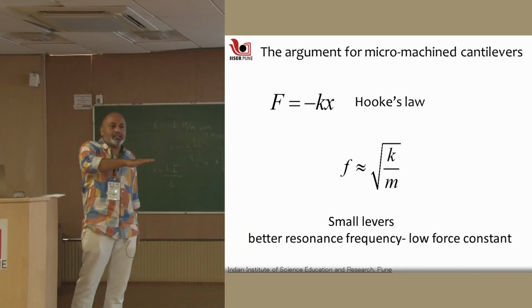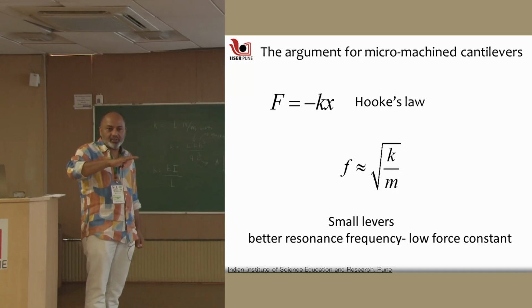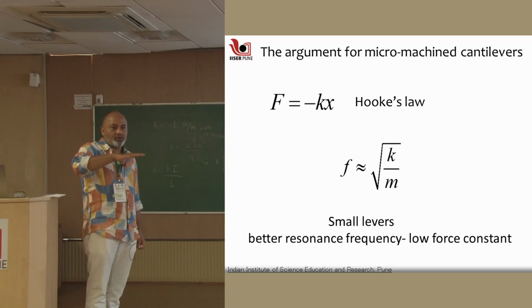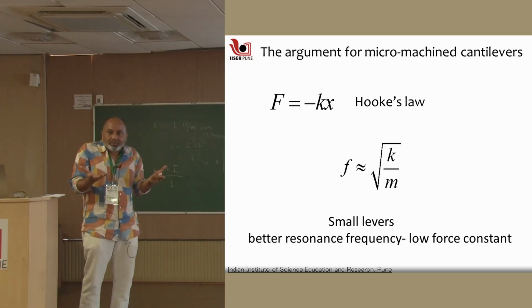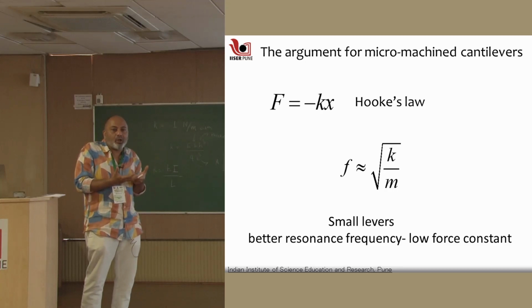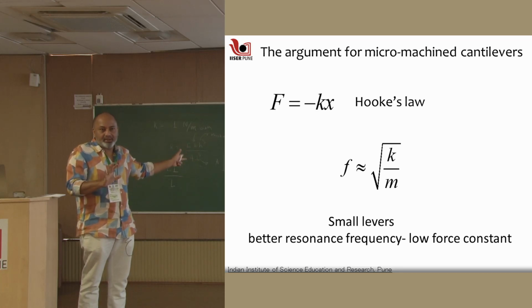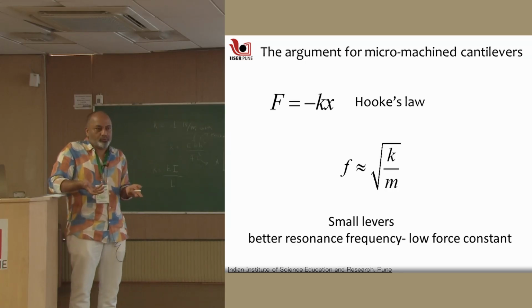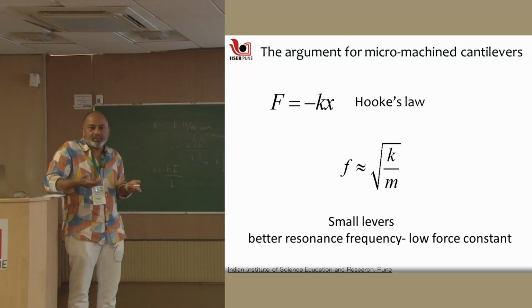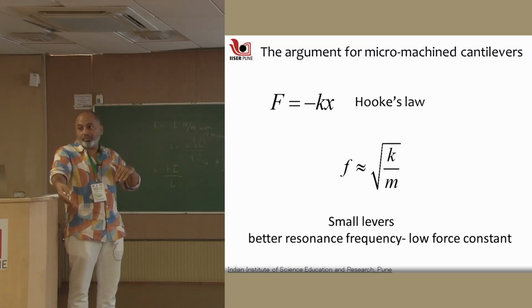Because I am taking this cantilever over the surface, and it goes from one point to another sensing force. If you have a sluggish cantilever with a lot of mass, it will not respond as quickly to a change in force as opposed to a small mass cantilever, and that's characterized by the inverse of the resonance frequency, roughly. So, if the cantilever's resonance frequency is high, it will quickly respond to force; it is not sluggish, it does not have too much mass. So, force changes over atoms, in between atoms, or from one atomic step to a lower atomic step, from here to there.